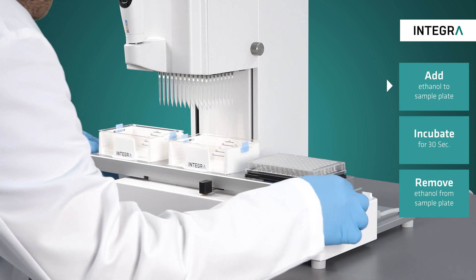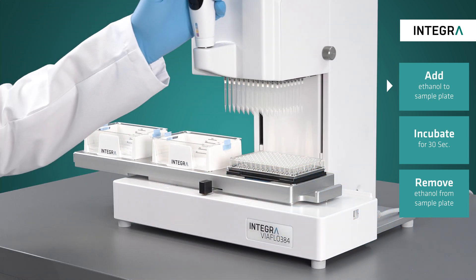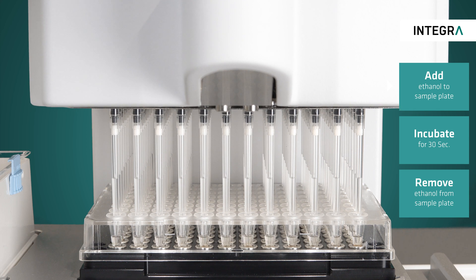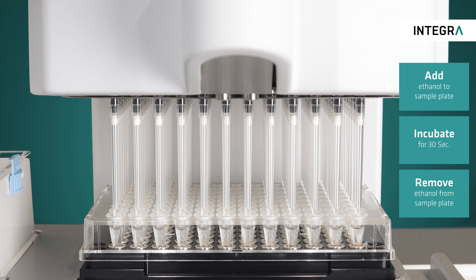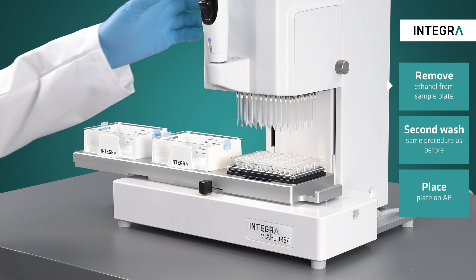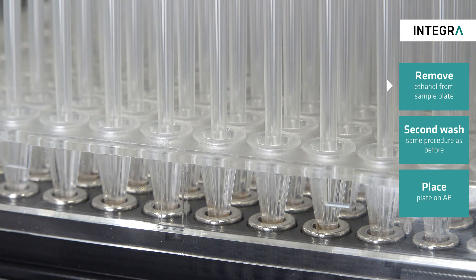Once pre-wetting is finished, the three-positioning stage is slid to the left and the ethanol is then transferred to the samples. After an incubation period of 30 seconds, the supernatant is once again removed — the perfect aspiration height is already exactly defined — and it is then discarded in the waste reservoir.